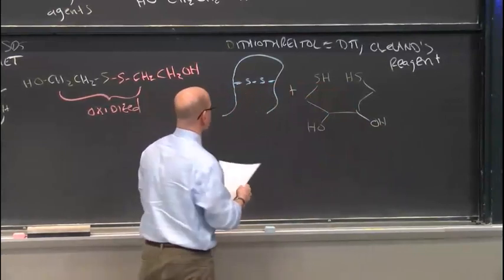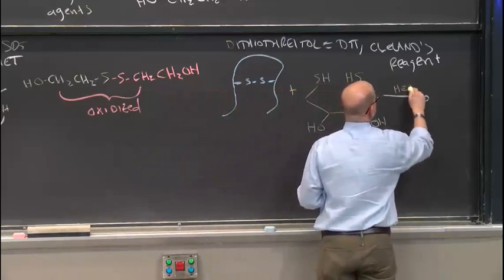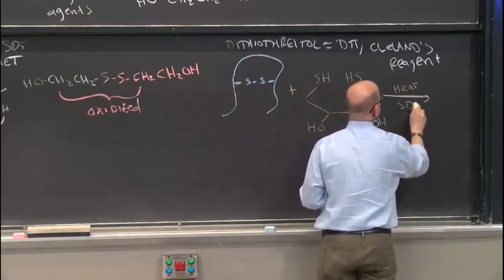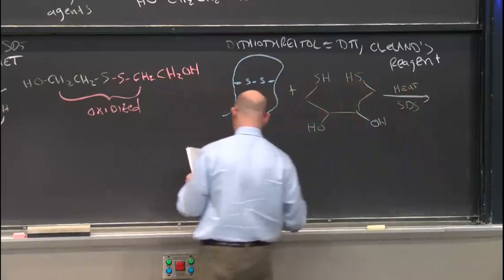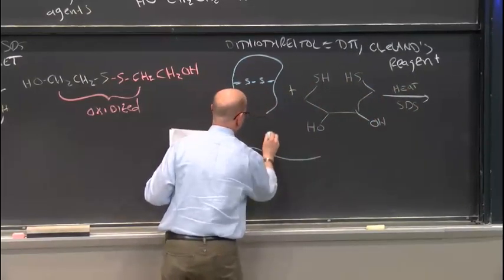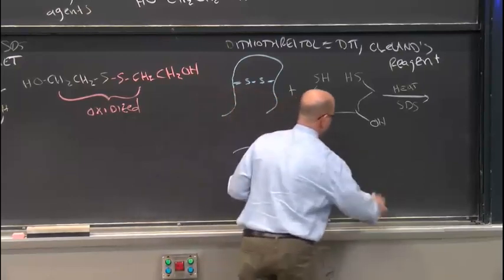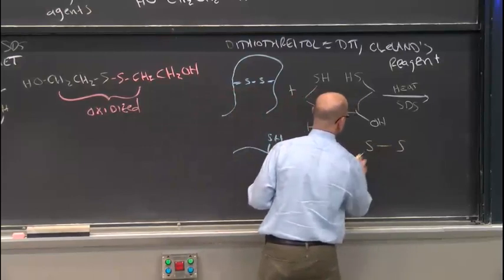Okay? And now, of course, if I heat this up, and I do this in the presence of SDS, what I will end up with then in the end will be my blue protein molecule that now has two reduced SH groups and Cleland's reagent now, which will look like this.